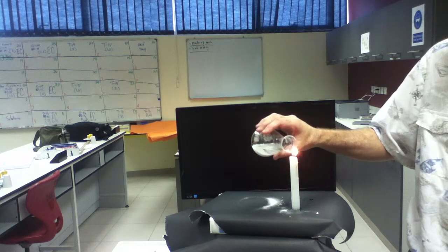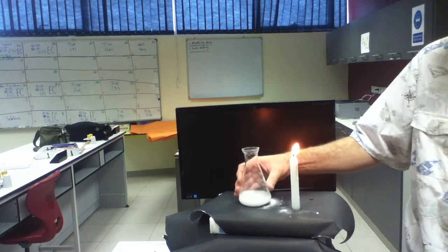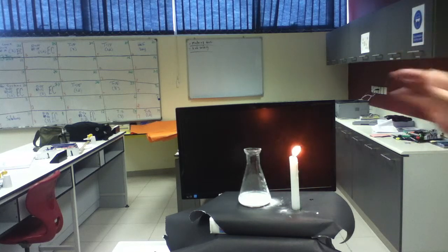There's not much left. All right, so much for that experiment. But what I'll do is I'm going to do it again. I'm just going to get a little bit more powerful acid, a little bit more powerful, not much, maybe twice, and I'll run it again. So this is part 1, and then you go to part 2. Clear? So everything is set up. Yes, I'll come back and I'll try it again.